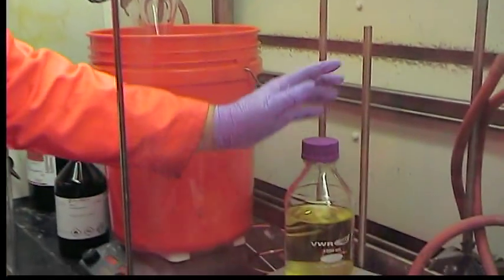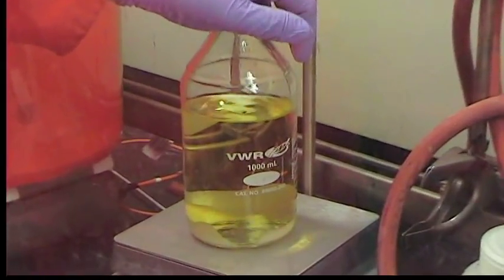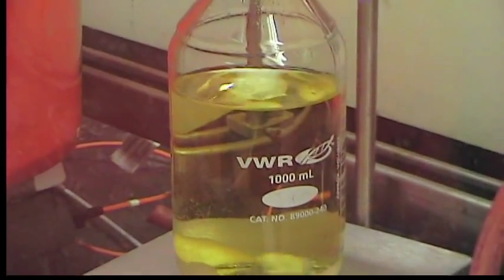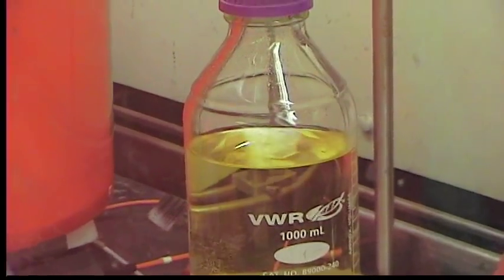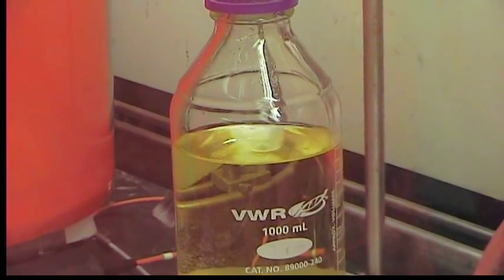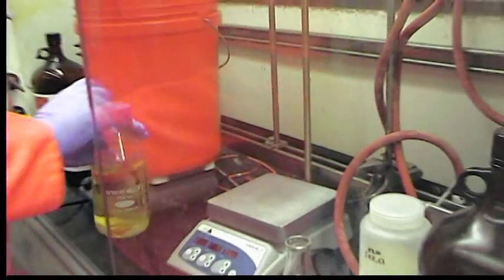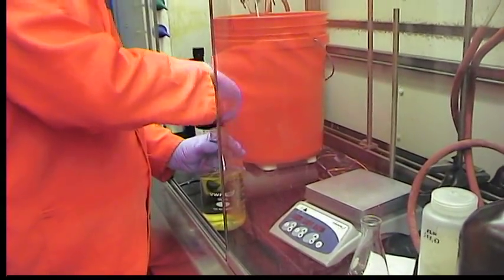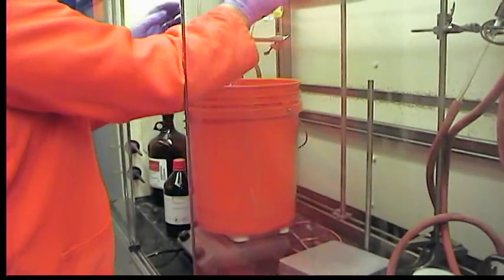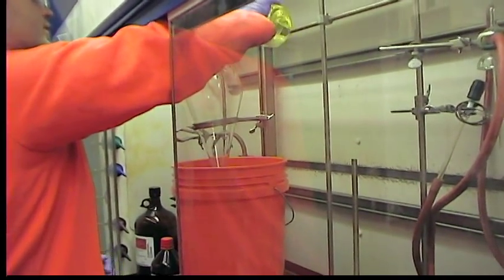We're not going to add the pyrylium salt directly, we're going to add it very slowly. Here on this stir plate I have the pyrylium salt stirring in acetonitrile. We're going to prepare saturated solutions of this, and these saturated solutions we're going to add them slowly to the amine acetonitrile solution.